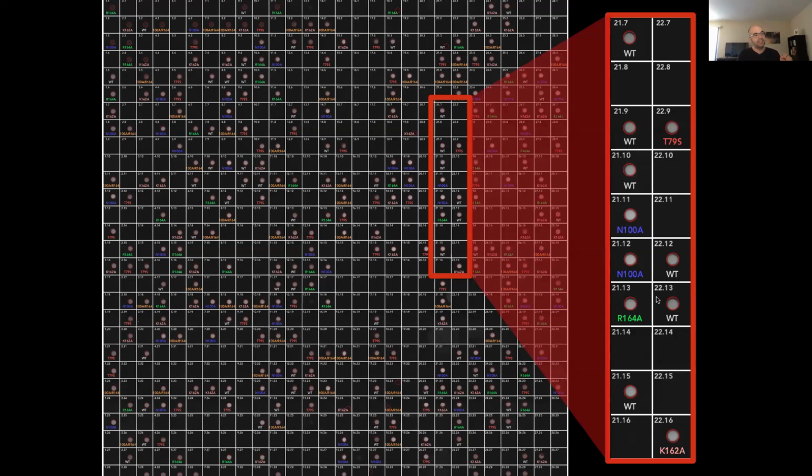Now, the important thing to know here is we have spots in chambers where we've deposited plasmid, but we don't see eGFP spots in the chambers we've deliberately left blank. And this is telling us our valves are working, and we're able to prevent cross-contamination throughout this process.